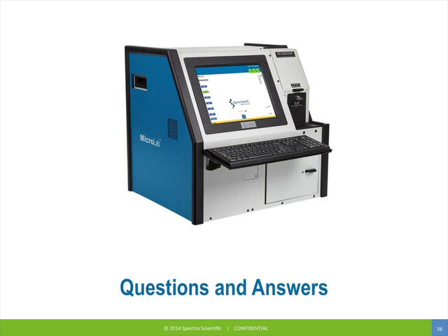Great. Thank you. Jim, perhaps back to you with this one. What is the detection limit for the wear metals? On the wear metals themselves, they're a little different. We're about plus or minus 5 to 7 on most of the wear metals. So would that be parts per million? Parts per million, yes, sir. 5 to 7 parts per million.